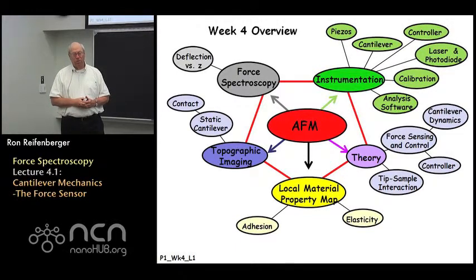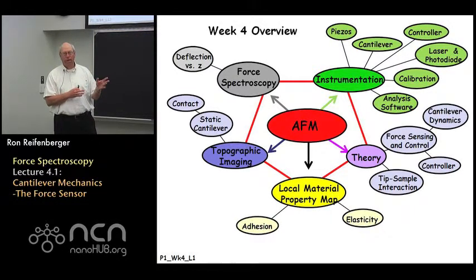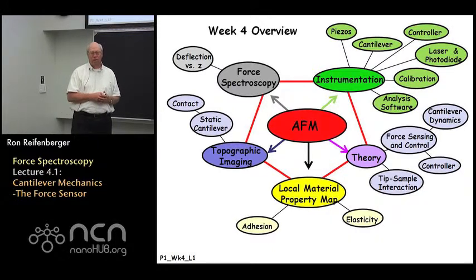In terms of a week 4 overview, we're continuing to expand our discussion of the atomic force microscope. And this week we're going to really focus on force spectroscopy and force versus displacement curves. We're going to discuss how force versus displacement can be converted to force versus distance. And of course, once you do this, then you can start to compare your experimental measurements to these theoretical ideas that we developed in weeks 1 and 2 of the course.